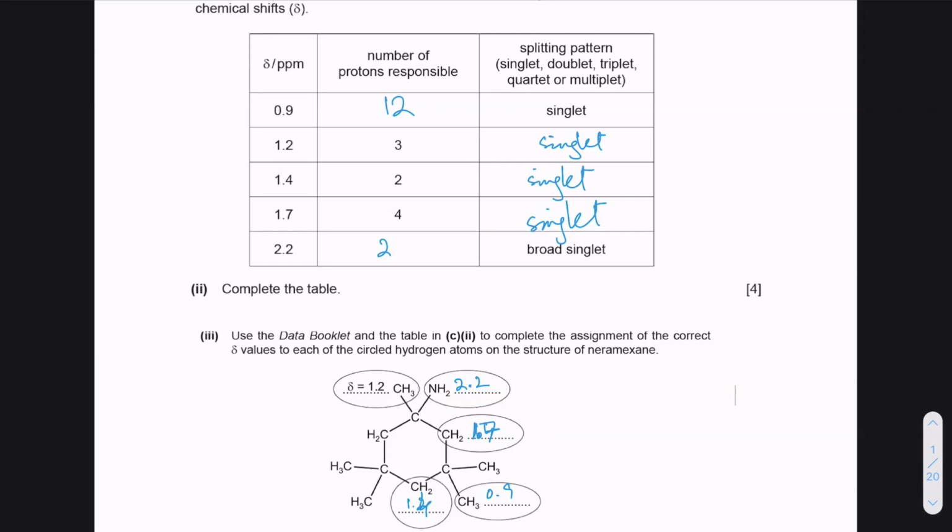Oh, okay. हाँ. And sir, how do we differentiate between a broad singlet and just a singlet? So a singlet is like this and a broad singlet is like this. Oh, okay, sir. Got it. Yeah. Sir, broad singlet हमेशा like NH2 वाले type molecules का होता है. Usually जो बहुत ज्यादा polar bonds होती है ना उनमें होता है ऐसा.